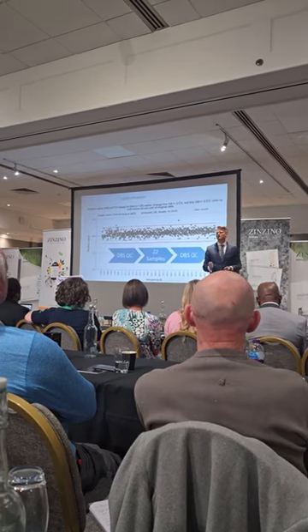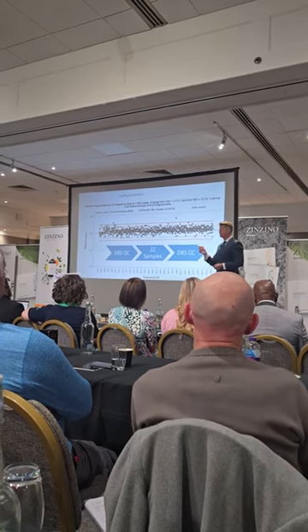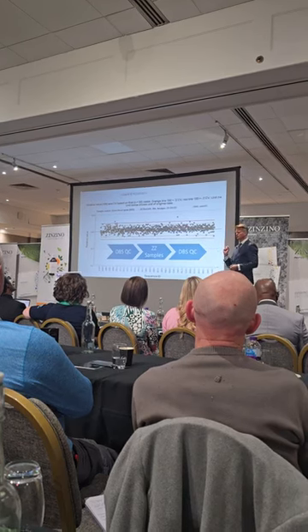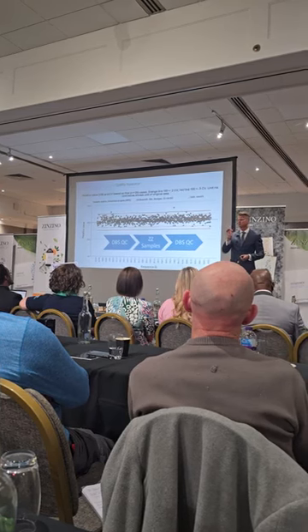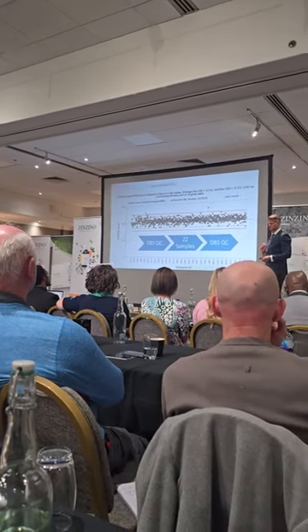So when we see something like this, we need to go through the calculations and see if we can find anything wrong. And if you do find anything wrong, we can correct this and then we can release the results. If we don't, we need to do the whole batch once more. And this is why we need the second sample, the B circle, right? So you need to send 2 samples. Most of the time we don't use it, but sometimes we need it to do reanalysis.